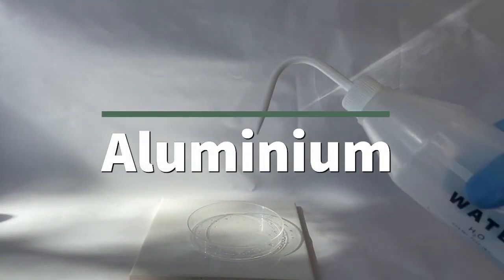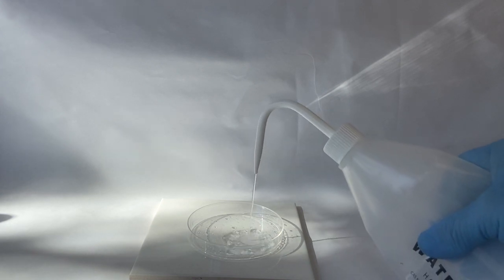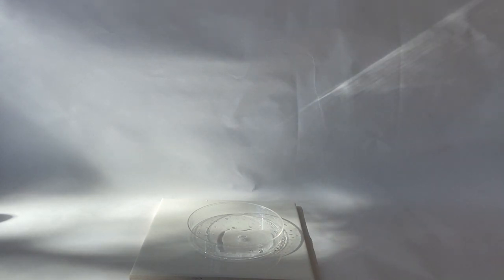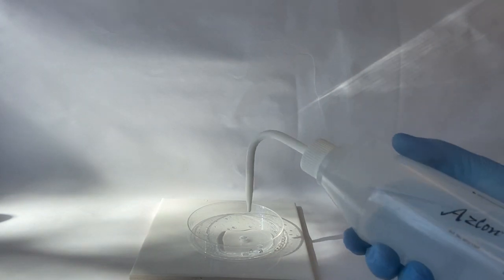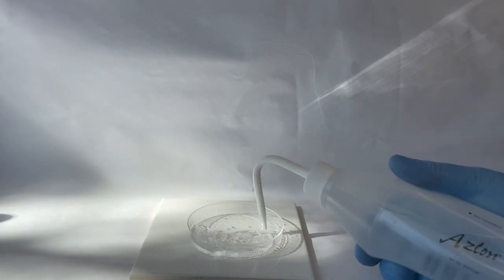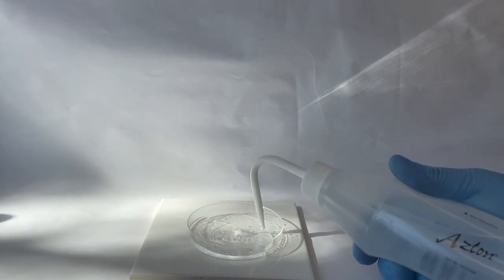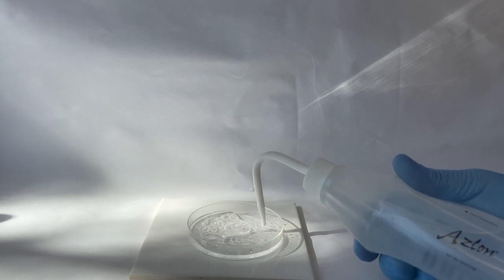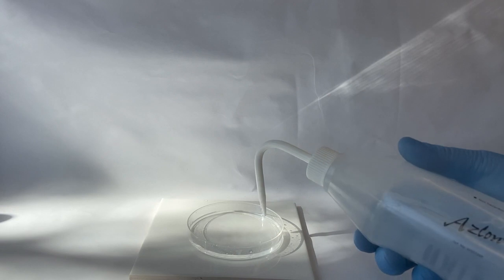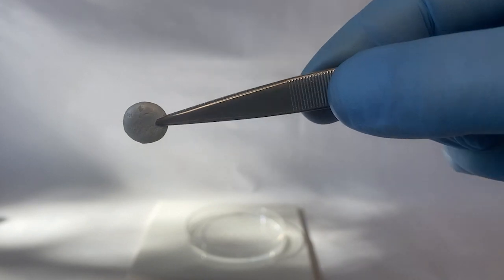Up next is aluminum. We're going to use a similar setup to our magnesium test. Fill this petri dish with some distilled water. We'll take a look at our aluminum metal before we add it to the water.